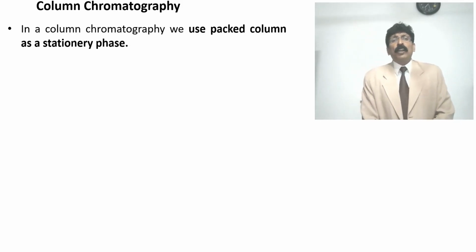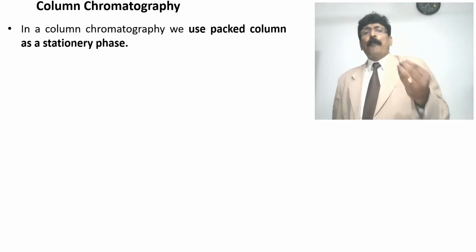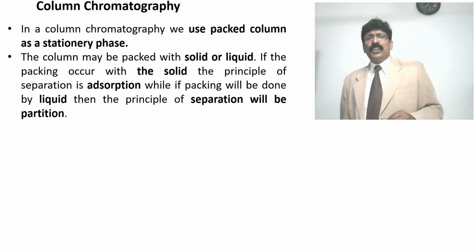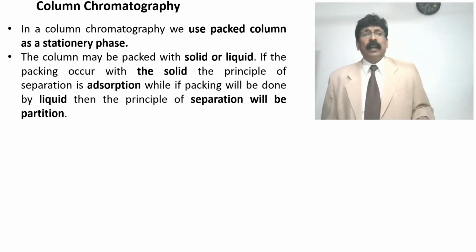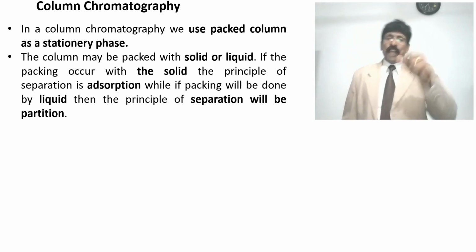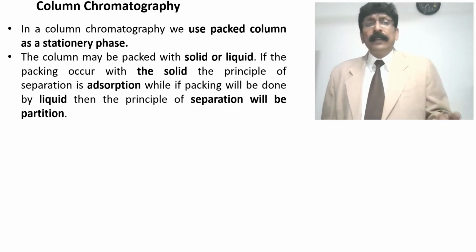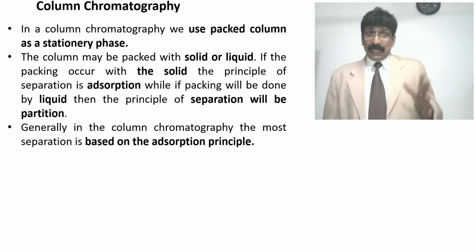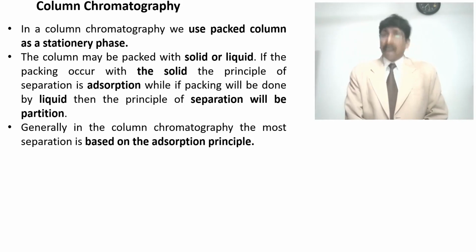When you come to column chromatography, we pack the column with a stationary phase. The column may be packed with a solid or a liquid. If the packing is a solid, the principle of separation is adsorption. If the packing is a liquid, then the principle of separation is partition. Generally, in column chromatography, most separation is based on the adsorption principle.